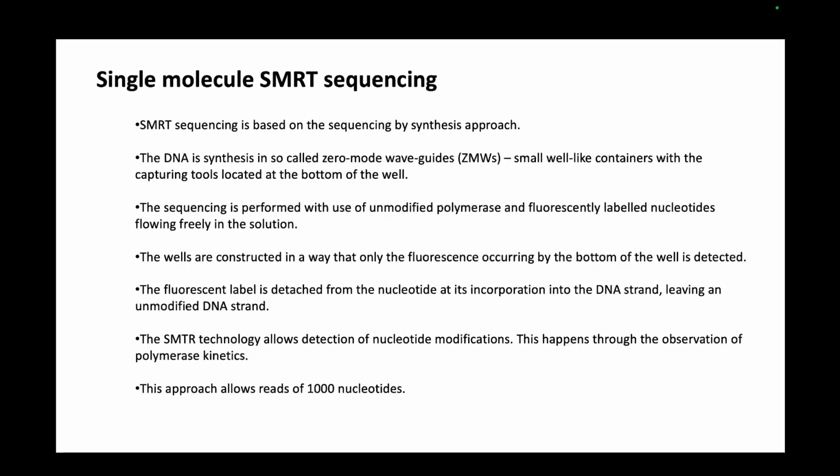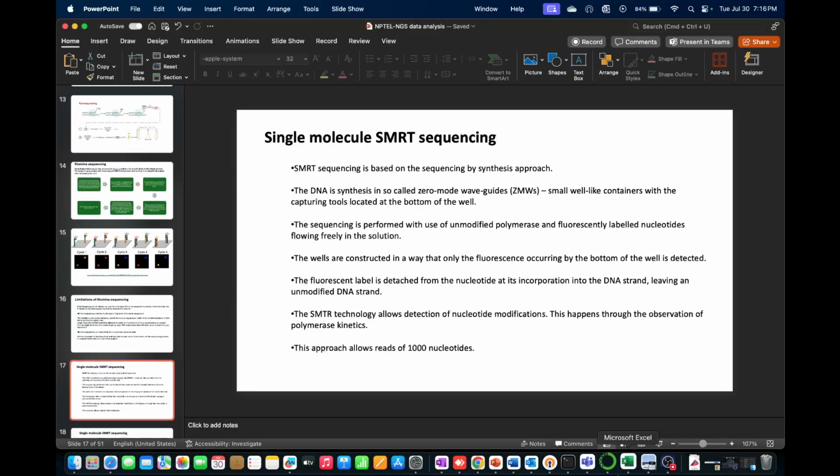Okay, so moving on from Illumina, the next big sequencing technology is SMRT. One second.